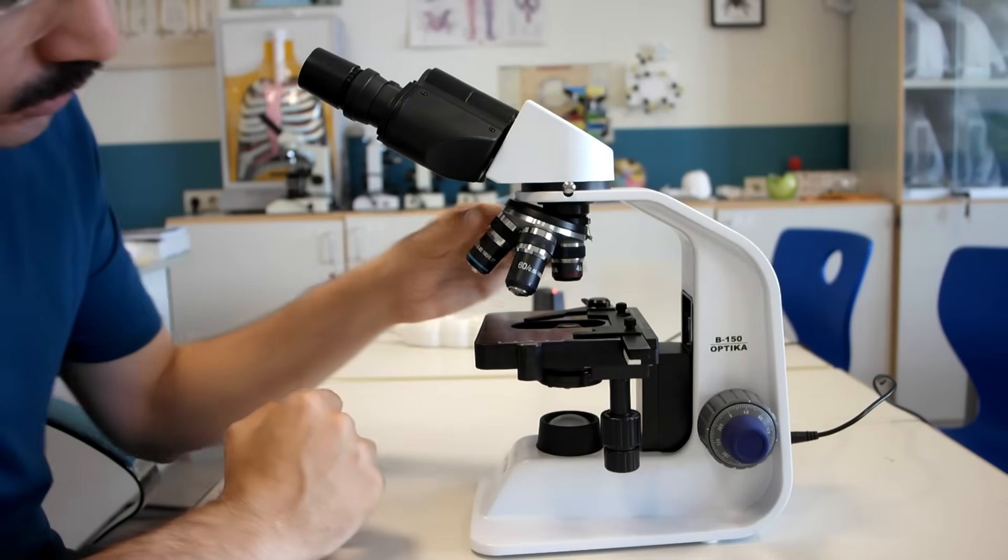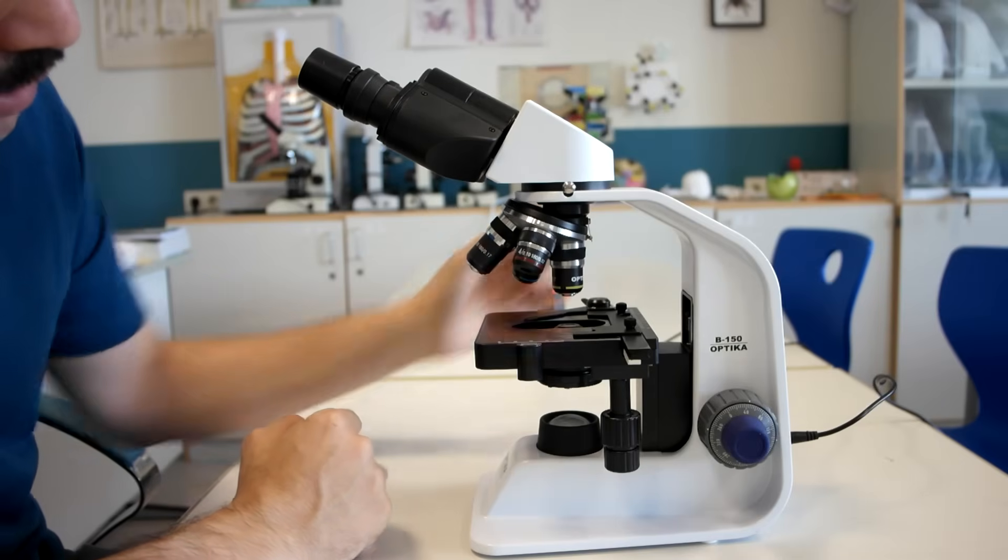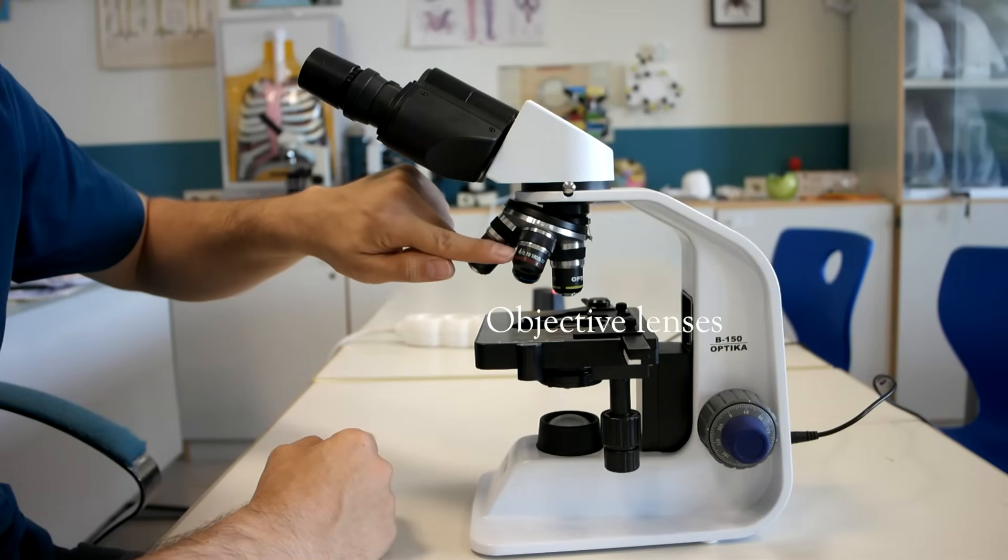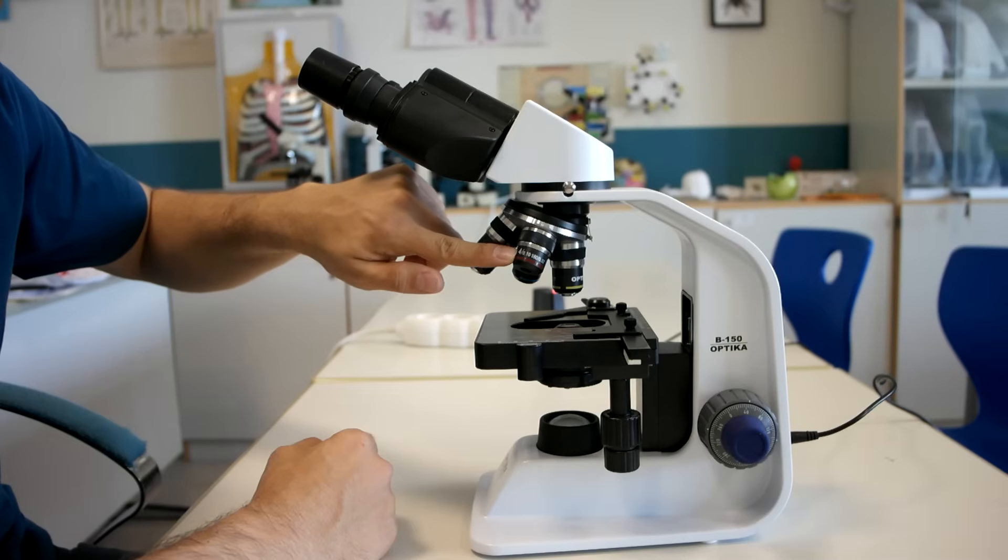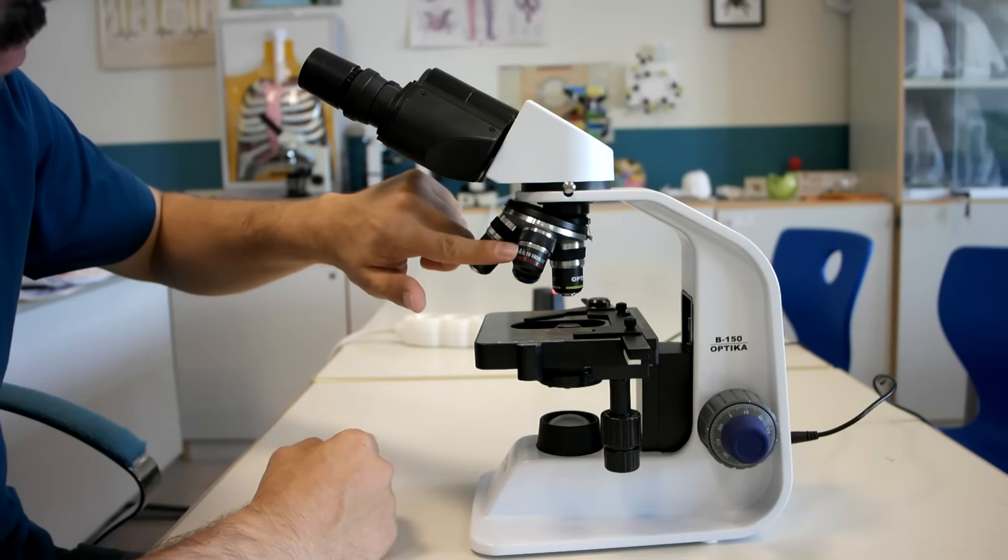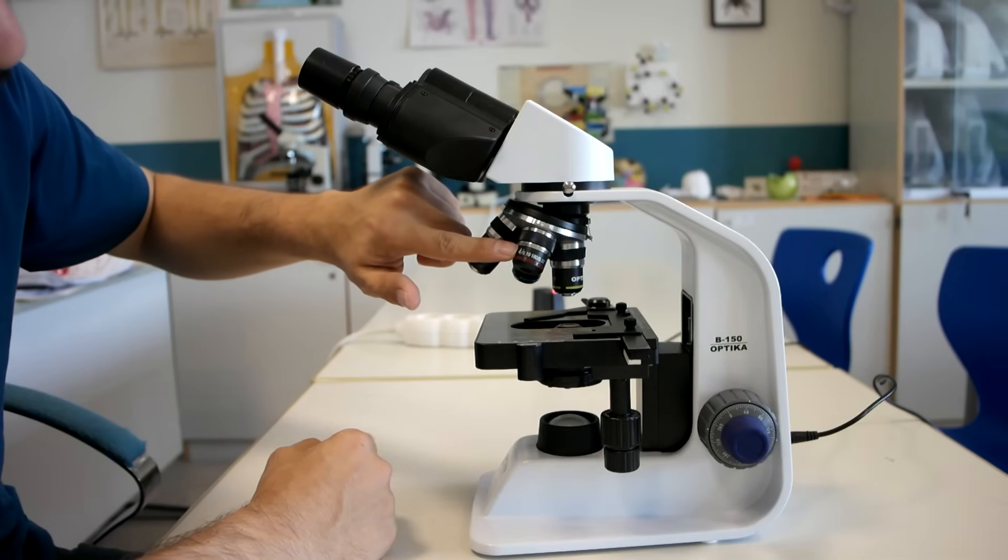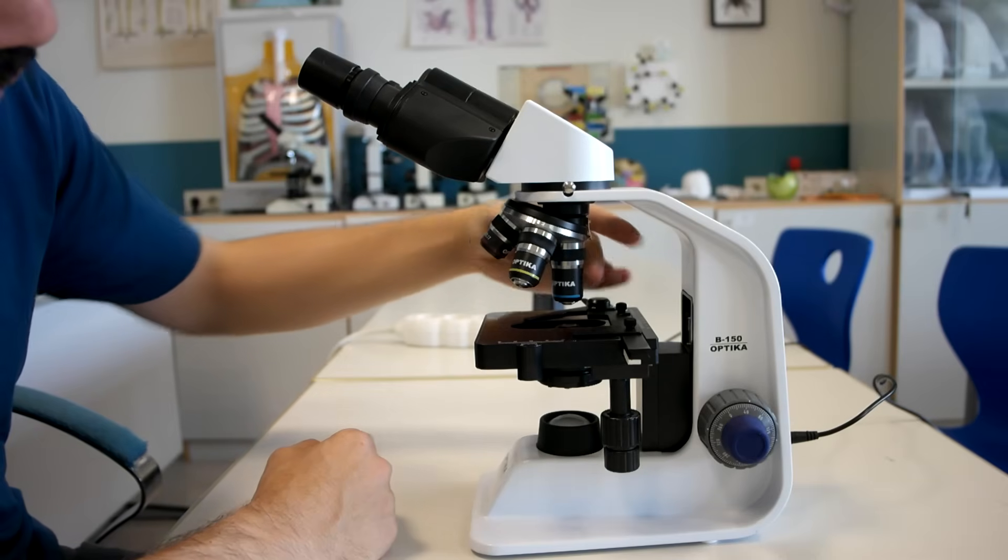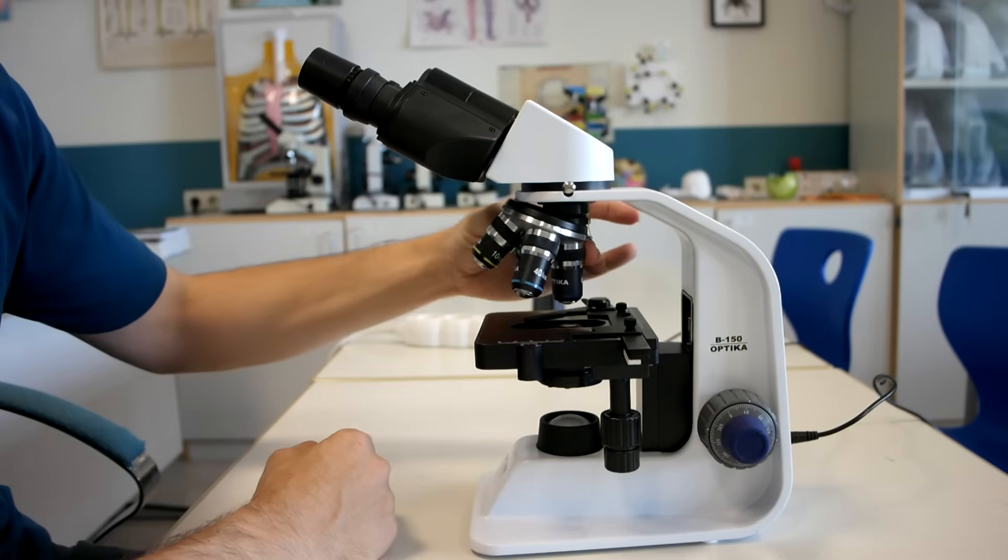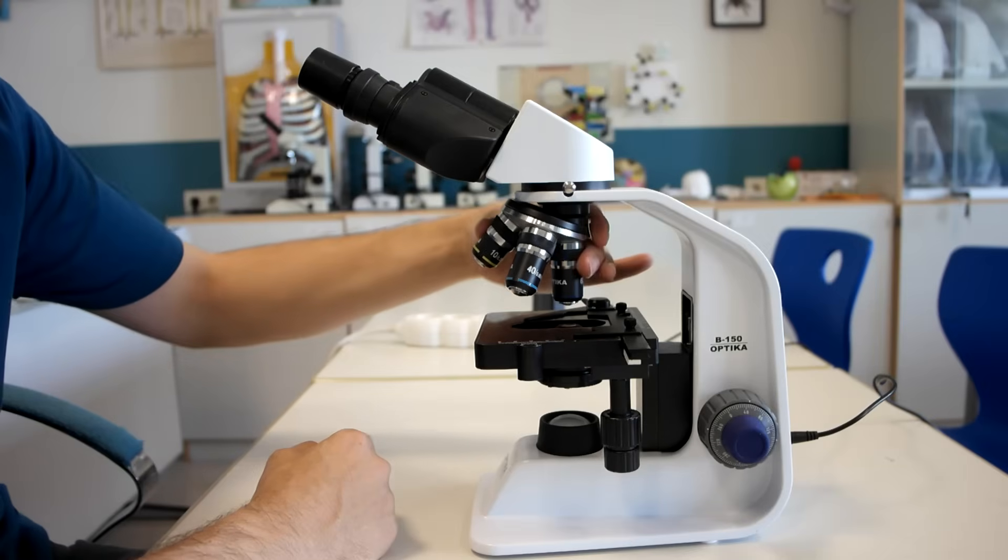This part is a nosepiece holding the objective lenses, and each objective lens has a color code, a different colored line or stripe showing the magnification power. This is 4, this is 10, this is 40 times objective lens.